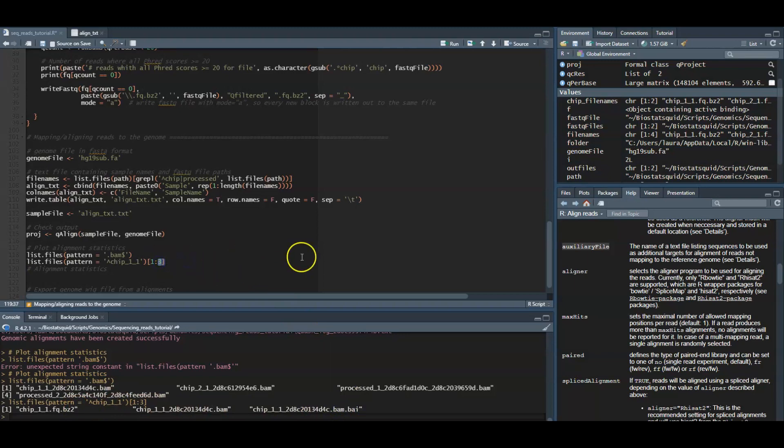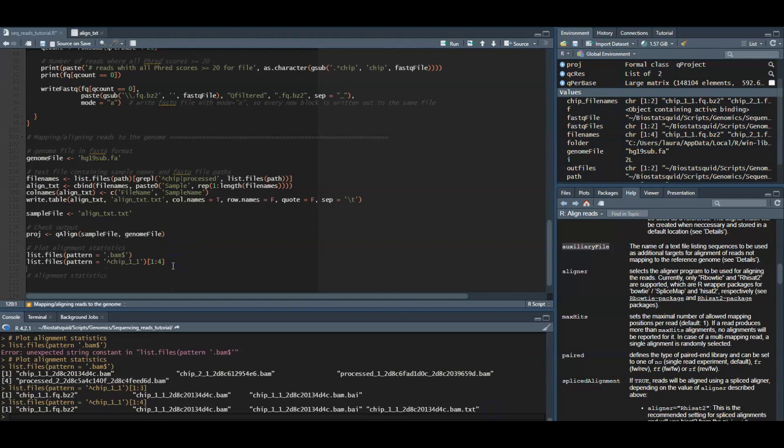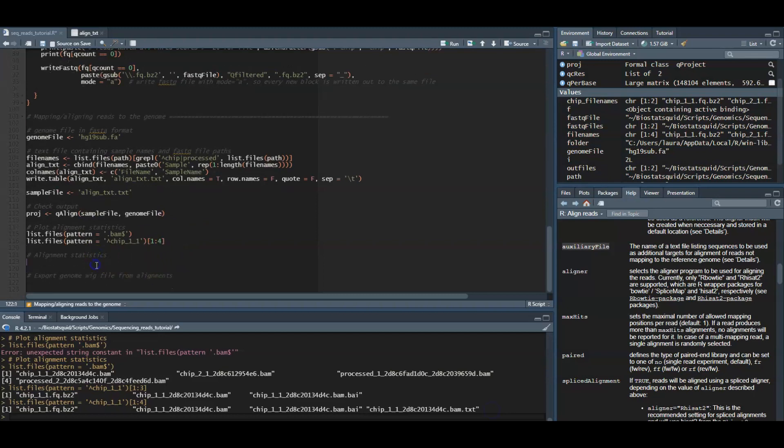Each alignment file will also have two additional files with suffixes .bai and .txt. So the BAI file is the BAM index used for fast access by genomic coordinates. And the text file contains all the parameters used to generate the corresponding BAM file. So you shouldn't delete it. Otherwise, Quasar won't be able to use the BAM file.